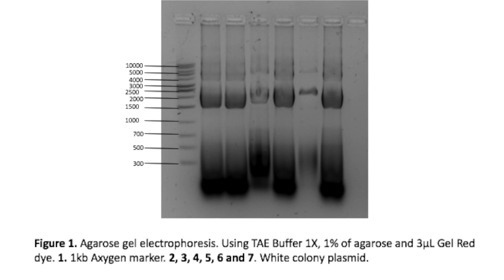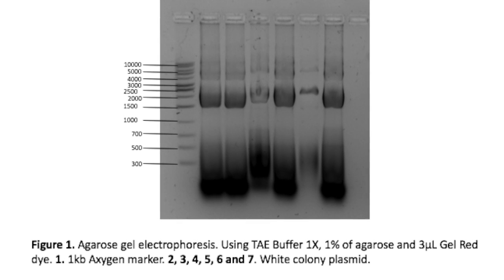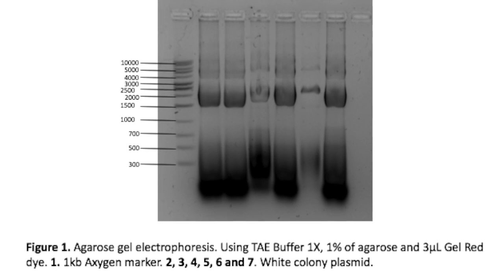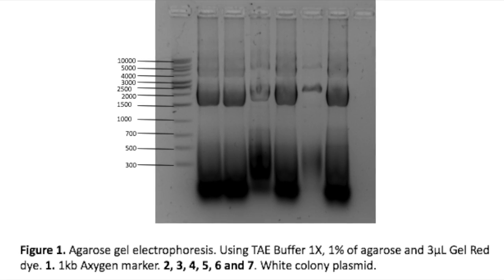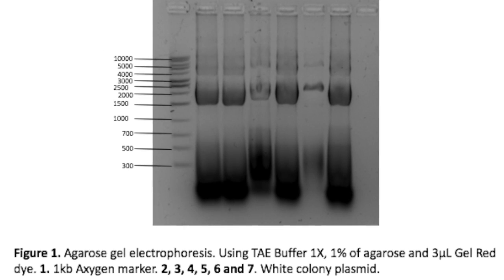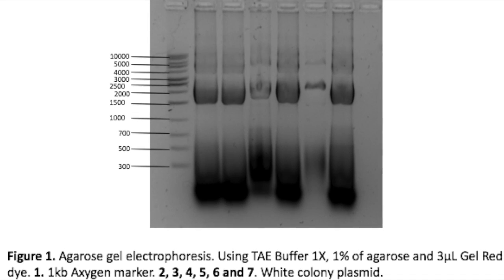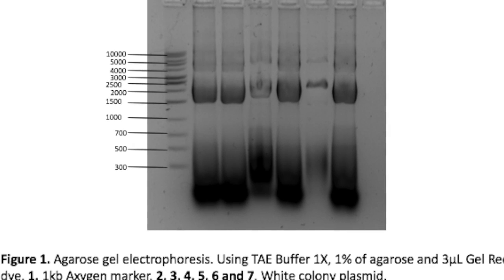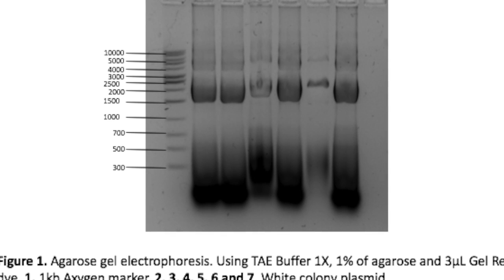In the electrophoresis gel, the marker bands are seen clearly. Also, there are degradation and some other different contamination that is shown with the blurred lines and the blots formed at the top and at the bottom of the gel. Also, there are lines shown at the sides of the lanes all along the gel. And finally, we can see the different bands of the isoforms of the plasmid.